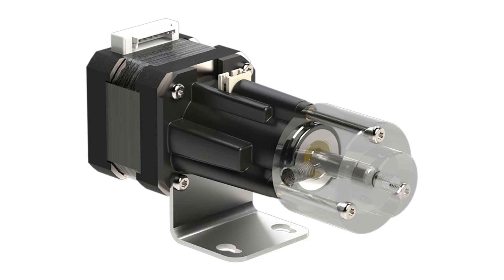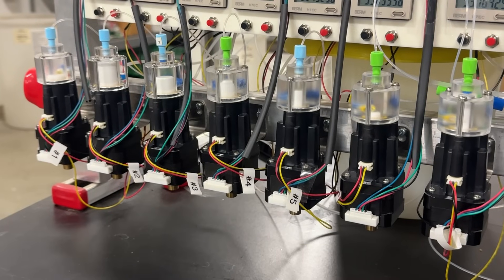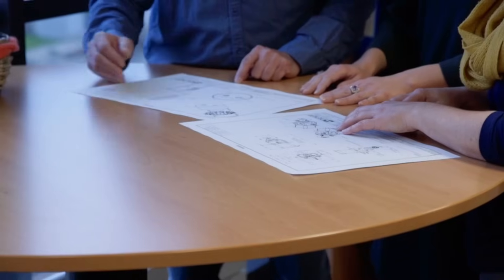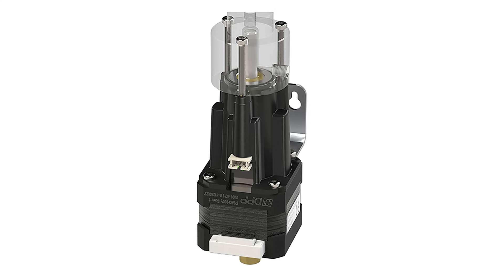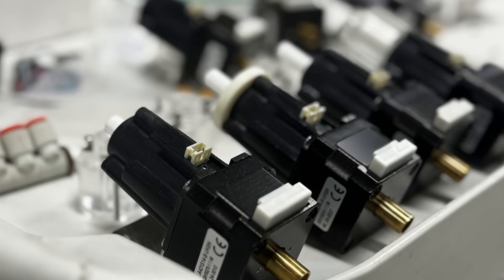Introducing the Xacta Series Variable Dispense Pump from Diener Precision Pumps, a breakthrough in fluid handling for critical applications. Designed with Swiss quality manufacturing and U.S. engineering, the Xacta delivers unmatched accuracy greater than 99.5% and repeatability you can trust.